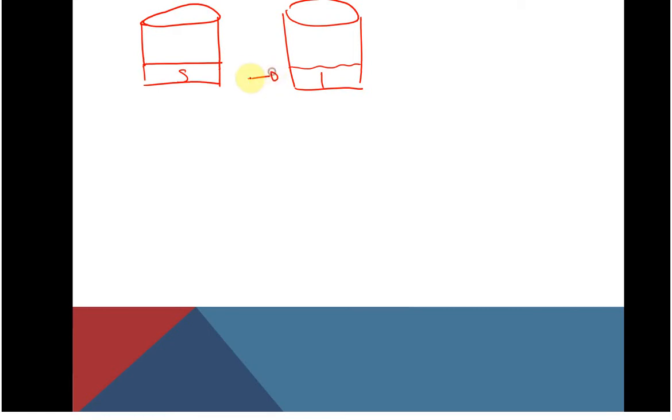You have this equilibrium going on where some molecules are freezing, some molecules are melting, and it's kind of where the term ice cold comes from. Okay. Now, in general, when we're talking about pure water, most of the time you can say it's going to freeze at 0 degrees Celsius. That does have a little bit of flexibility depending on if your thermometer is calibrated, which may or may not be the case in lab, and also depending on humidity, atmospheric pressure, and so on. There's a little bit of difference there. But we can say generally it's going to be in the vicinity of 0 degrees.